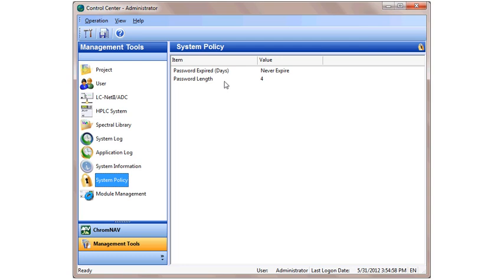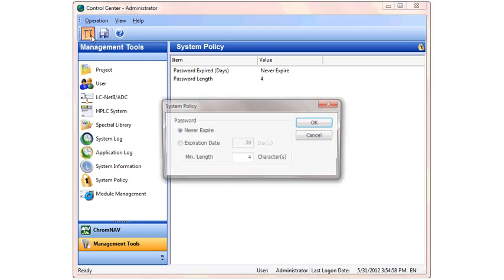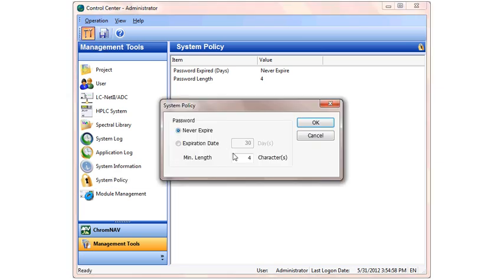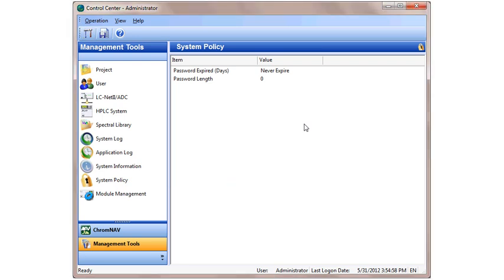You'll notice the current minimum password length is four characters. To change that, click Edit and change the minimum characters to zero, and click OK. We can now create a user without a password.